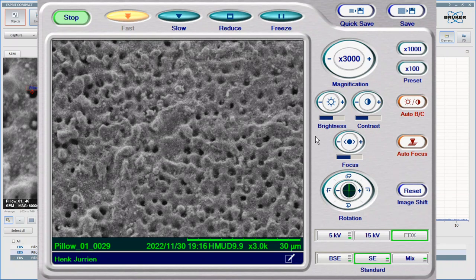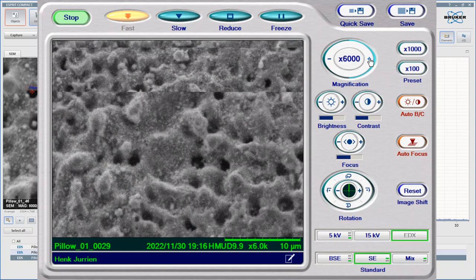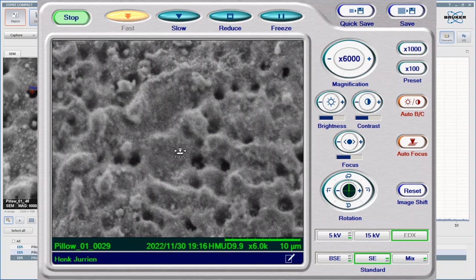And that the material is being pushed down because the toroid is going into the surface, so the center of the toroid will be forcing material into the material, okay? So that is, in my view, why we are seeing what we are seeing. That's my current view. I might change it, and that is my choice.